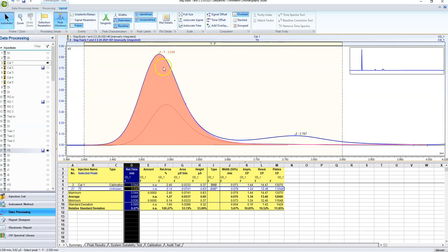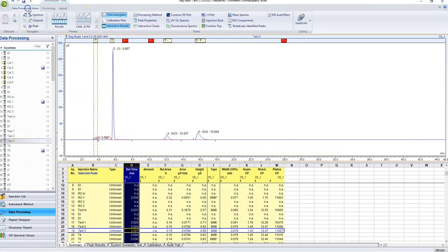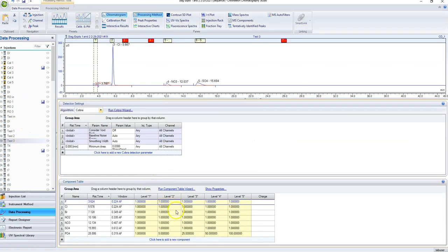This is a really useful tool for peak checking, making sure that your peak is actually what you think it is. You should always do this if you're ever worried that something is not the same chemical as was in your calibration standard. So all you really need to do is put all of the values in for your calibration points. So like if I wanted all of this data, I would need to fill all of this out before I take all my data off, copy and paste it into Excel, and if you ever get stuck, just ask someone who's familiar with the IC to help you.